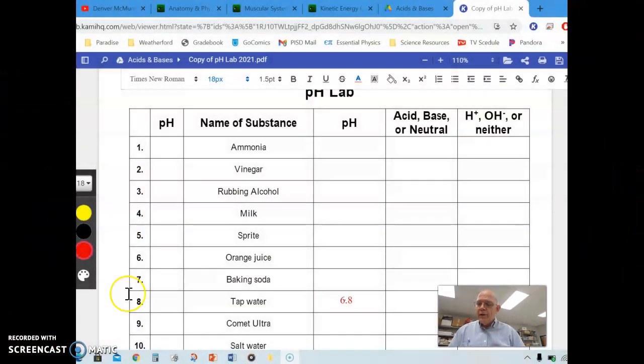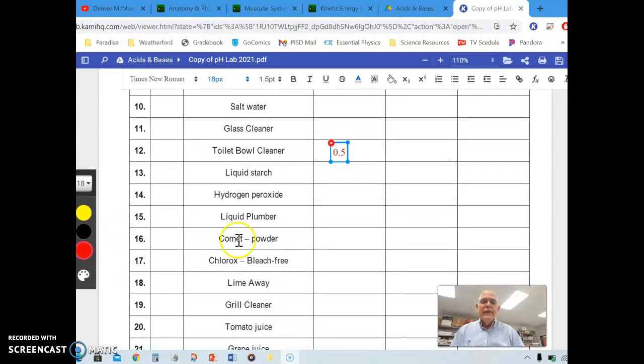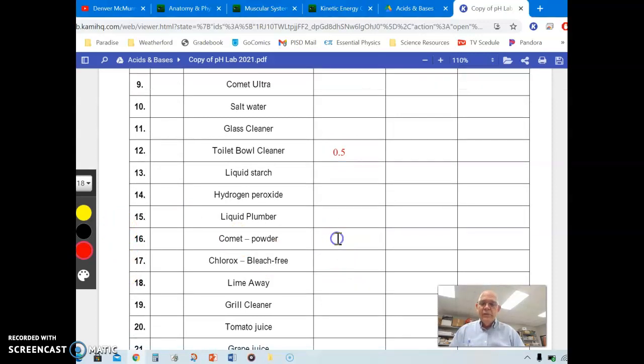Now it is very, very dark. I'm going to say it's about somewhere around 11. It's hard to tell exactly, but we'll say 11, okay? So it has a pH of 11. So we're going to go over here and find Comet Powder, which is number 16. And we are going to put 11 right there.